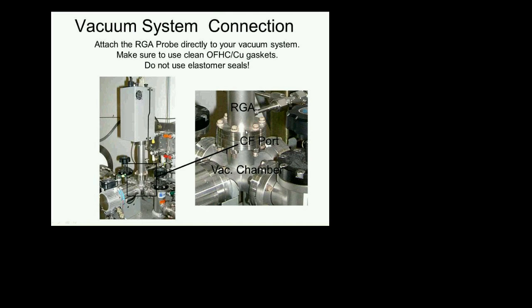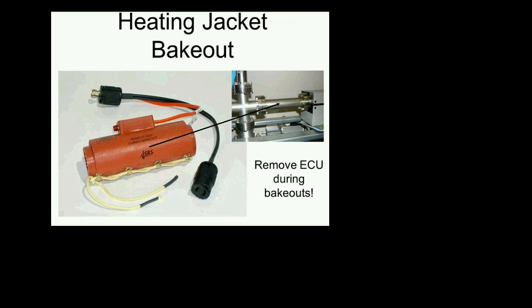In this case, the connection is made via a conflat port. There is a copper gasket here. You install the RGA, seal it with the copper gasket. There is no outgassing or leaks to be expected from this, and you have the best possible situation.